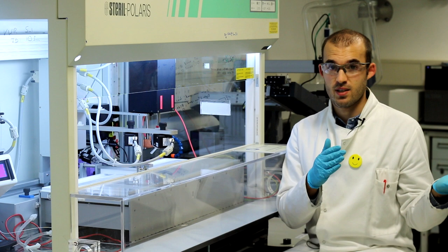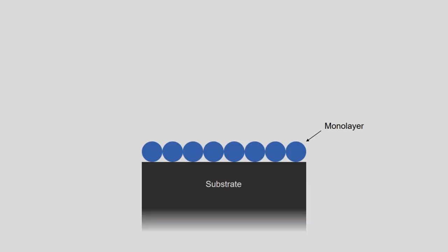We keep our trough in a closed environment to prevent drafts in the lab from moving our floating monolayer.